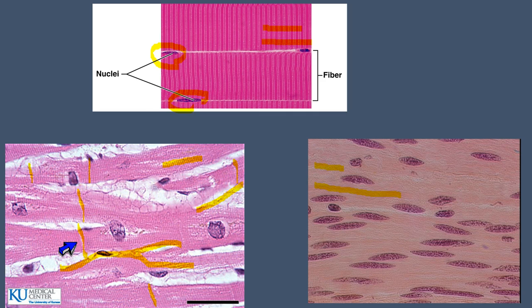So you need to be able to identify into first those four broad categories of epithelial, connective, nervous, and muscle. And then you need to be able to subdivide the three different types of muscle, the various types of epithelial, nerves, you basically can identify the neuron, and then connective tissue, you have all the various types that you need to be able to distinguish between.